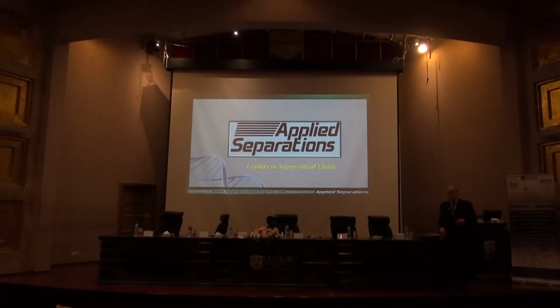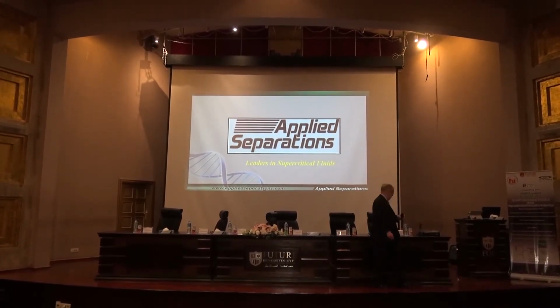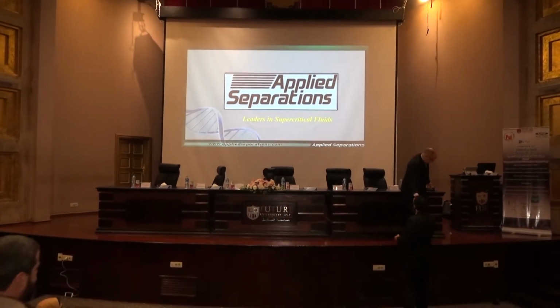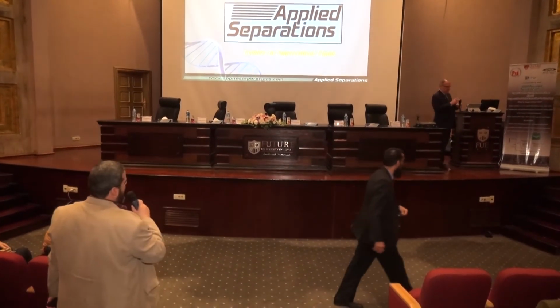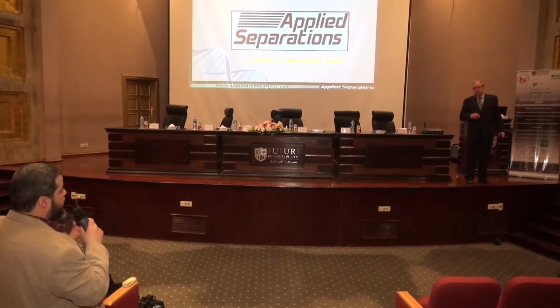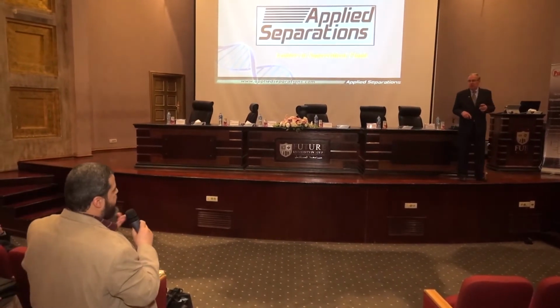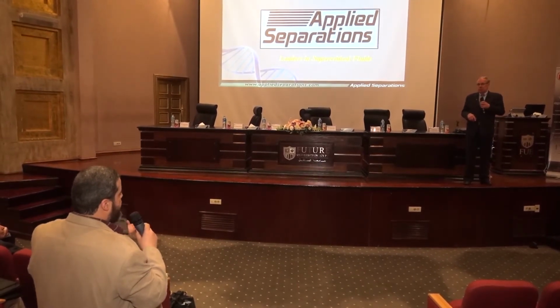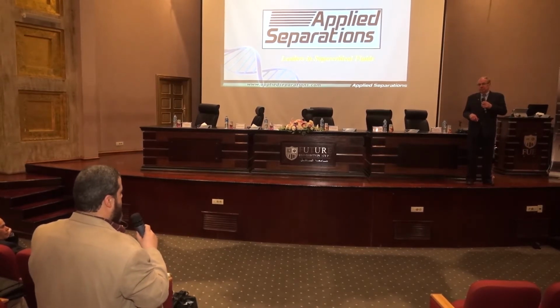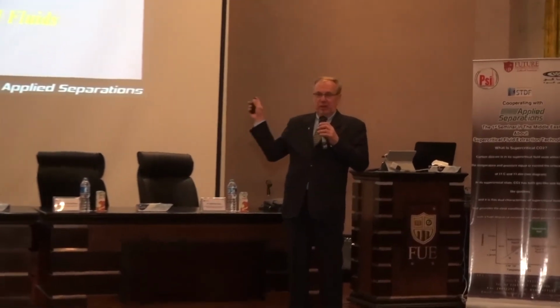Sir, I have one question. Is it possible to use the supercritical fluid in the extraction of liquid culture, for example? Usually we are using solid materials for the extraction using supercritical carbon dioxide. Is it possible to use liquid for extraction? For example, if we're working with bacteria, we have culture or media, and we have a natural product, a secondary metabolite, in the media. Is it possible to extract these compounds using this technique? To extract liquids? I will talk about it at the end of the talk, and then I think I will answer your question that way. Very shortly, yes. But then I will show you a couple of techniques to extract liquids. Yeah, absolutely.